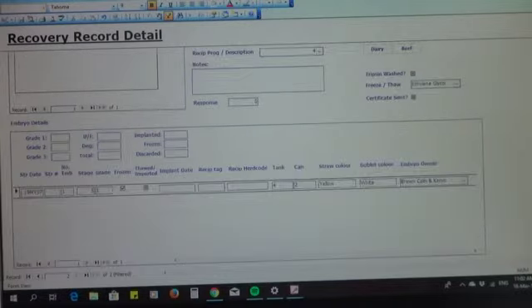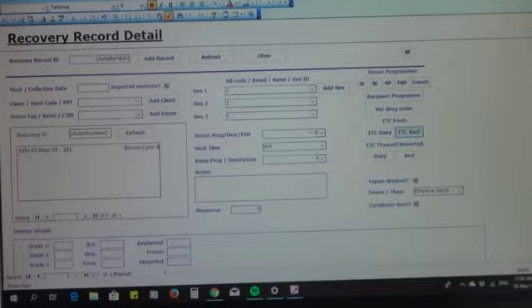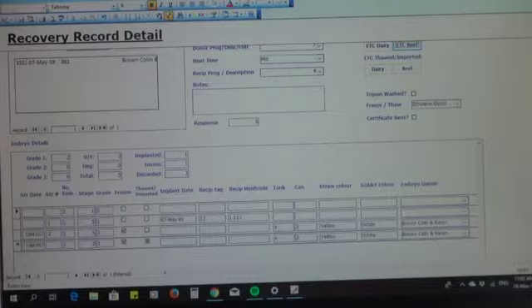Okay, so this system can be made more. Up here it says that we had 3 unfertilised out of 5. There was 1 implanted and 1 frozen. So this information here is taken from down here. So we really want to just streamline the whole thing.